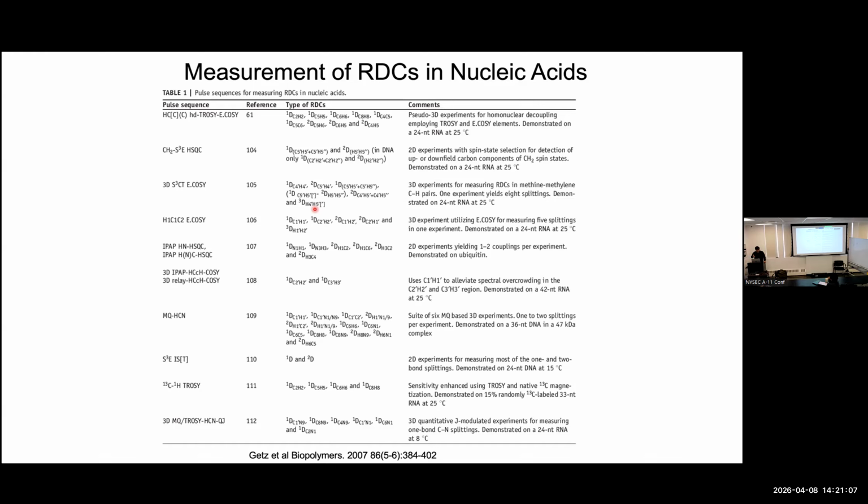Now the cosine pi J delta is not 1, it's some number. So when I measure the new spectrum, the intensity has been diminished in a way dependent upon the scalar coupling value J. Because if J is bigger, we're quickly around the cosine. If it's small, it's not. So you can encode splittings in the intensity of the resonance.